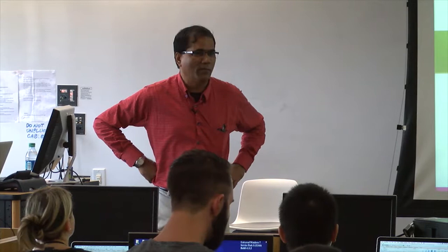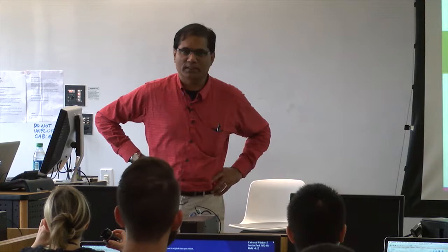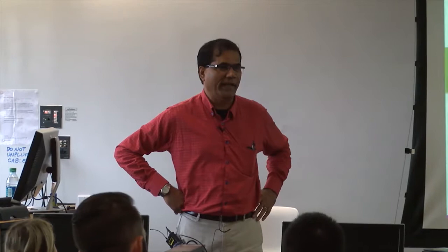Today, because in this summer program you are all going to learn about the analysis of the sequencing data, what we'll do is understand the technologies in general, other than sequencing, though we'll mostly emphasize sequencing. We'll cover the need for the development of technologies, how we did that, and how we developed the data that people analyze at the click of a button, the science and thinking behind developing those technologies, okay?